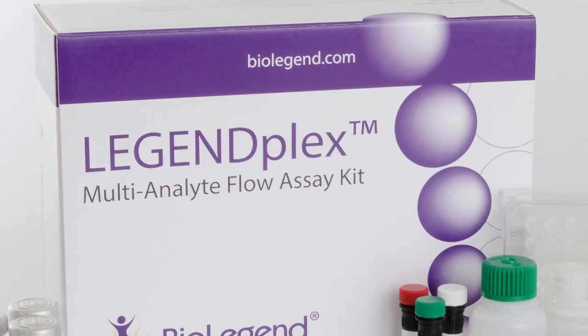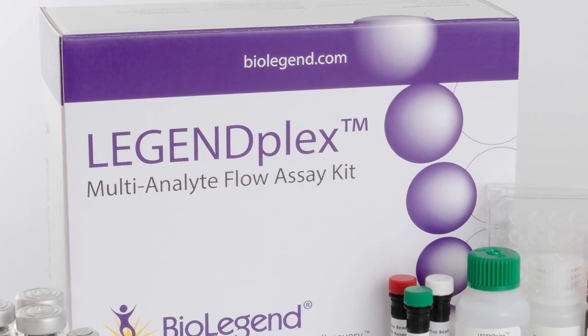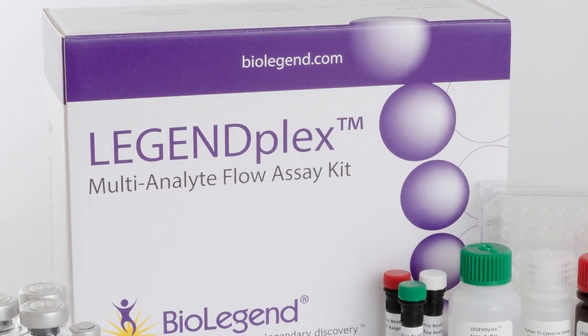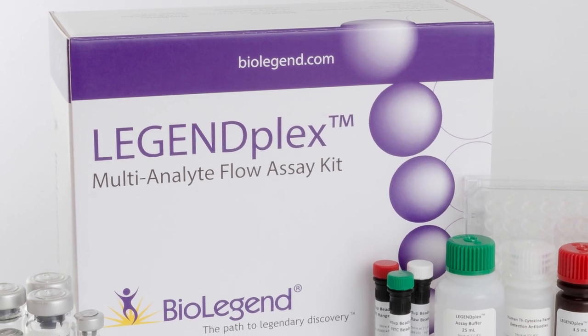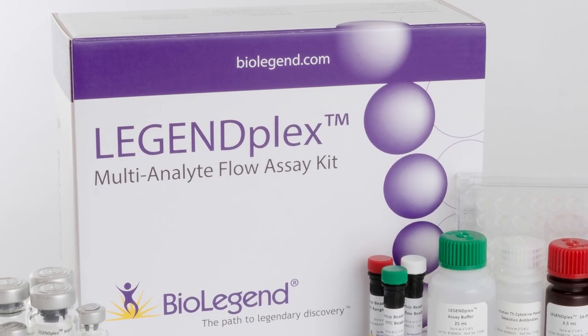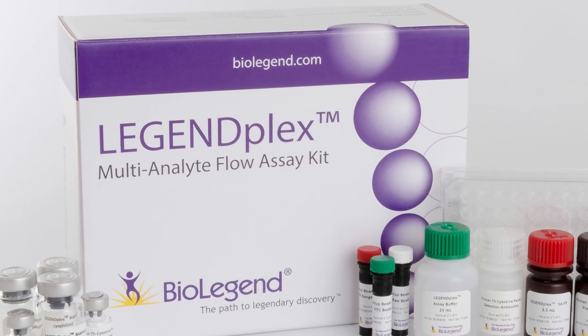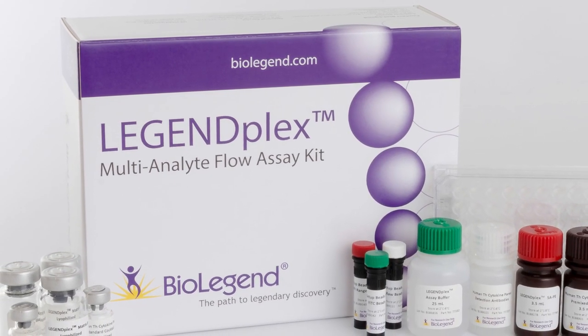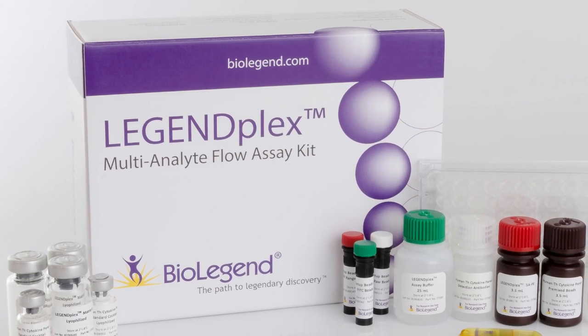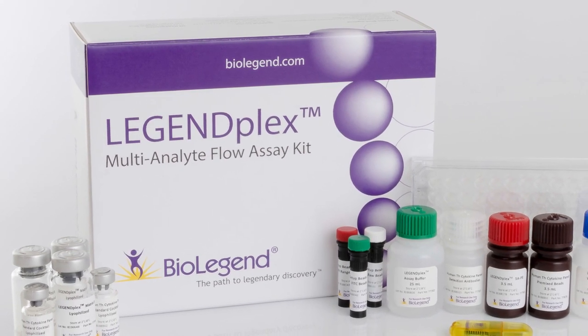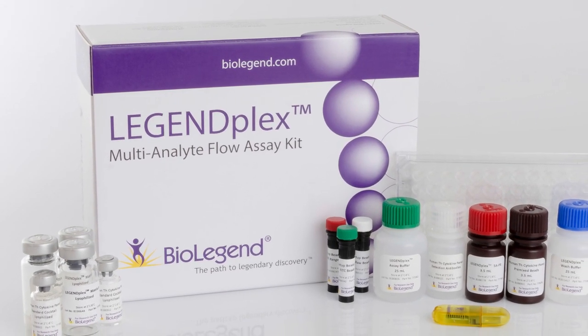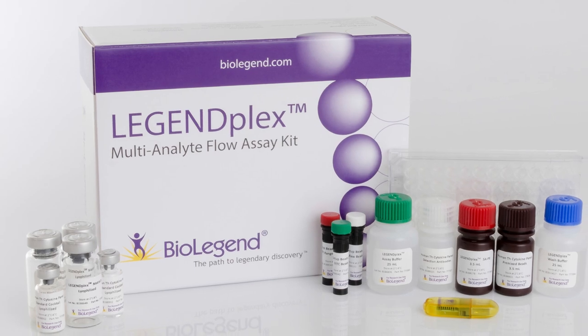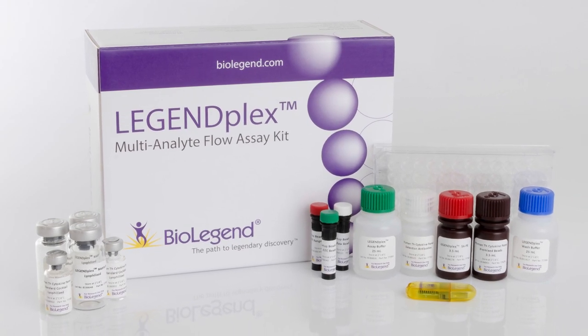Once installed, the software can be used to analyze flow cytometry files generated from our LegendPlex immunoassays. This tutorial will cover all the steps necessary to analyze a typical LegendPlex dataset and assumes users have followed the protocol included in their assay manual.